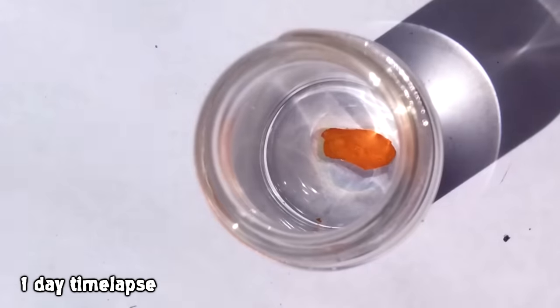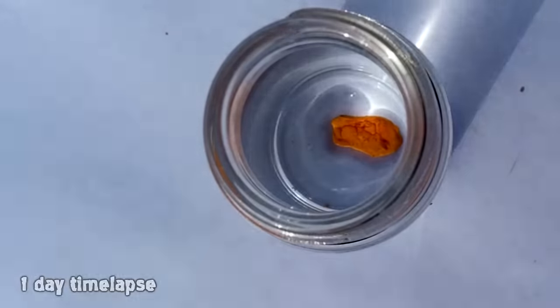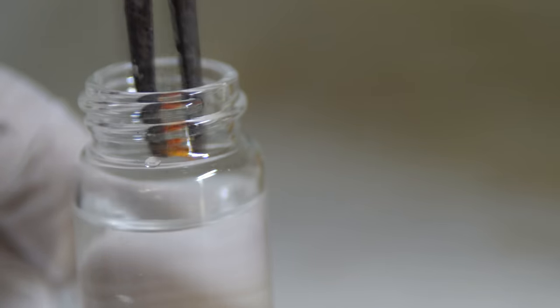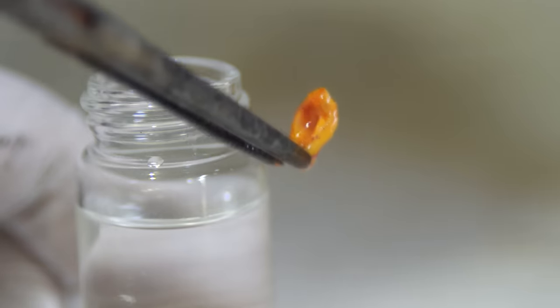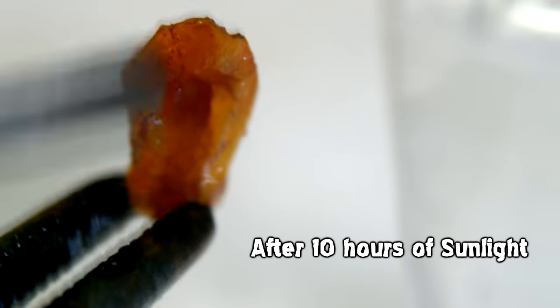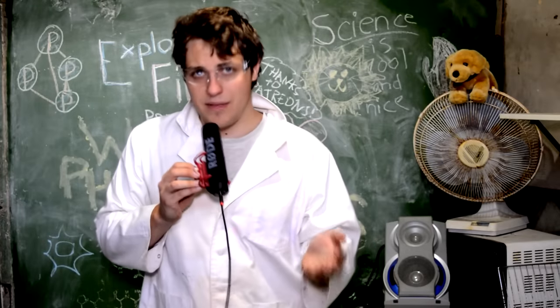This is a time-lapse over a day, and we can see that it doesn't really affect the inside of the phosphorus, but the outside is coated in a red layer of red phosphorus. When we take it out of the water we can see it smokes a lot less than it ordinarily would, because that red phosphorus layer is stopping the white phosphorus on the inside from oxidizing.